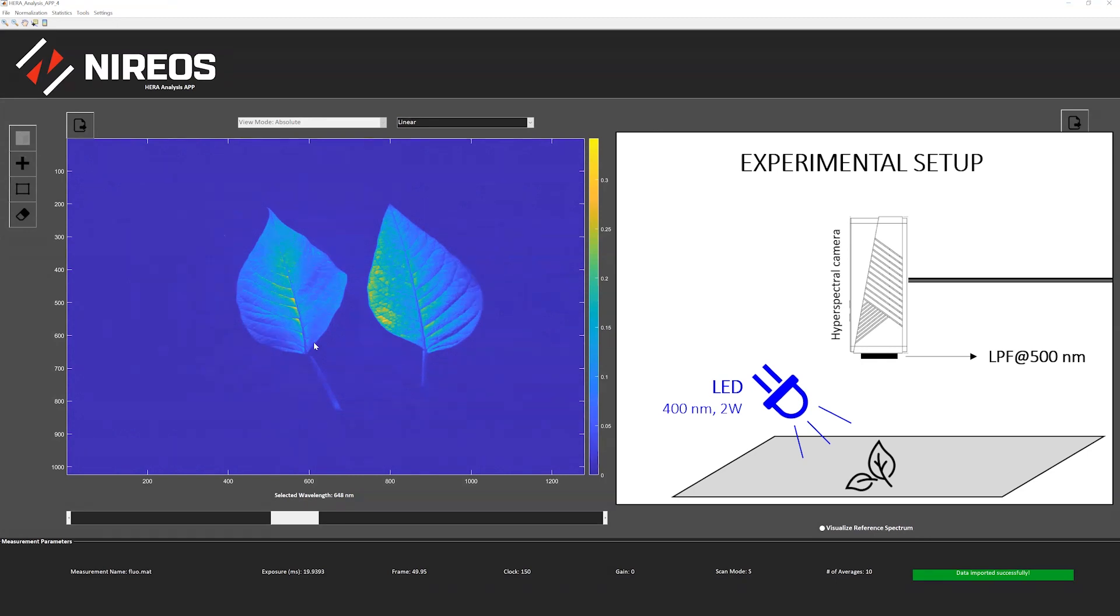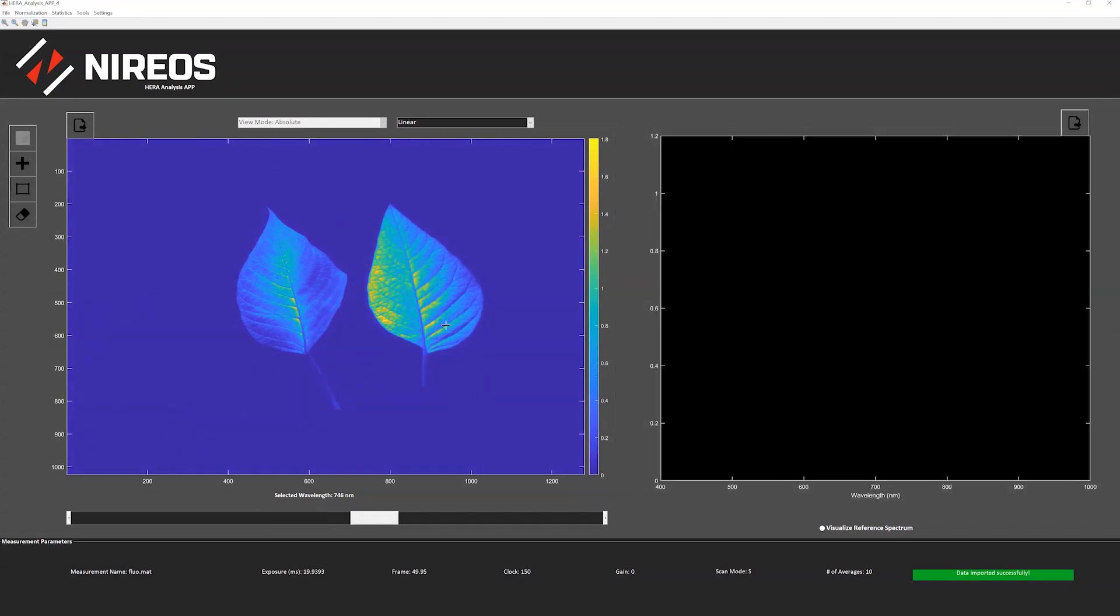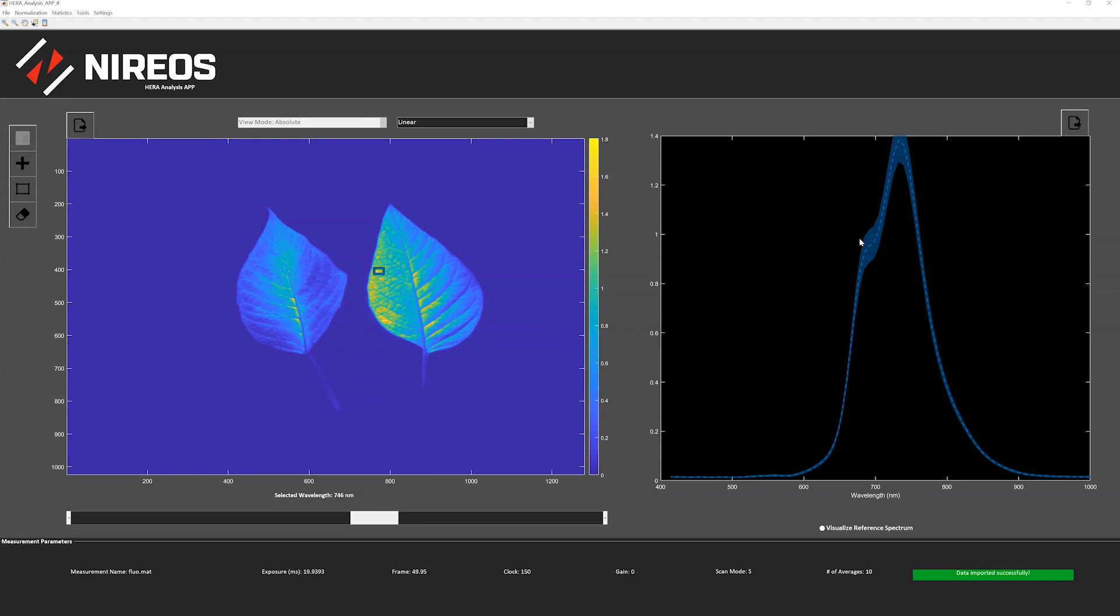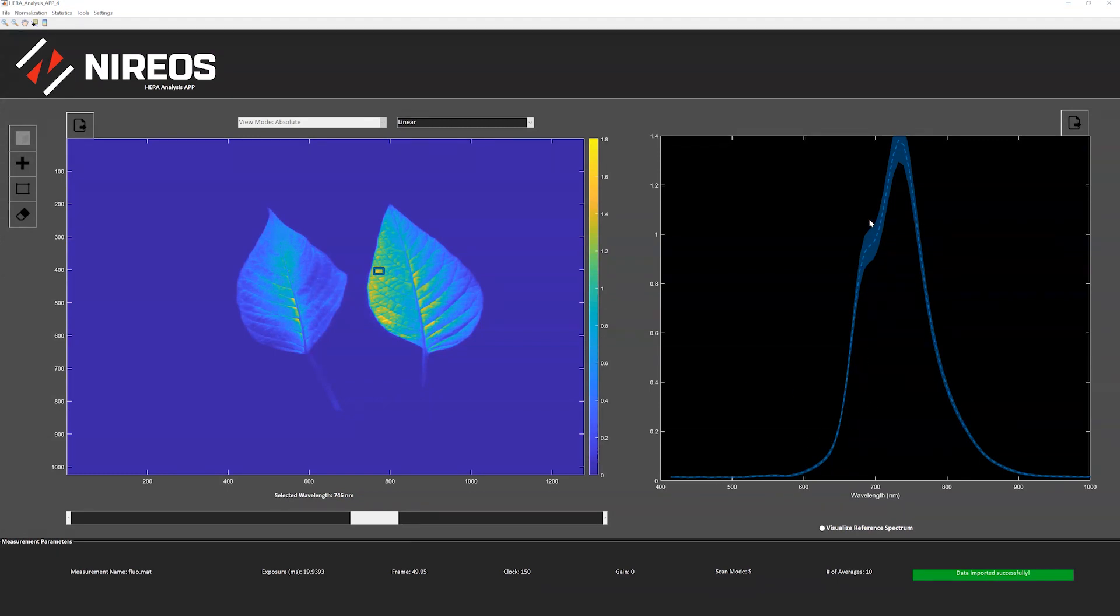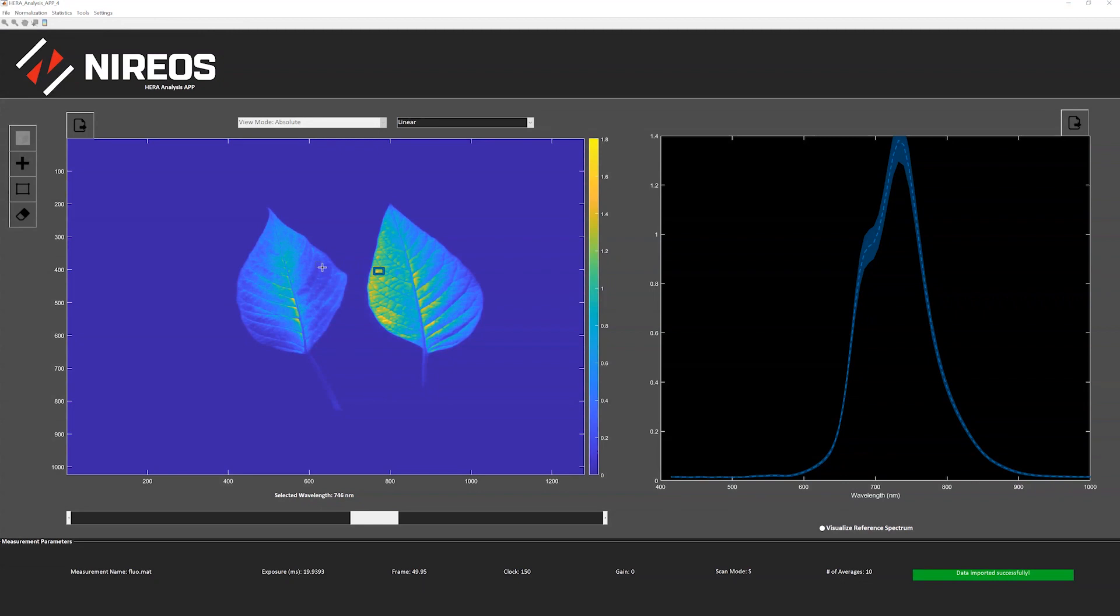Basically, we took the hyperspectral image of the fluorescence signal emitted by the chlorophylls. We can also plot a couple of spectra just to show you the high quality of the data. This is the typical emission spectrum of chlorophylls, and we can choose also another area of another leaf here. You can see that the spectra are quite different.